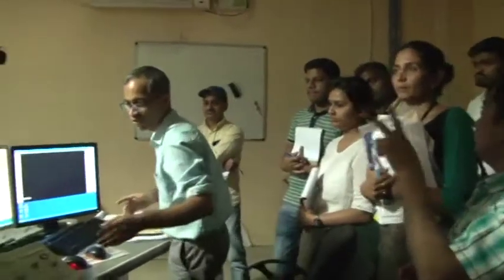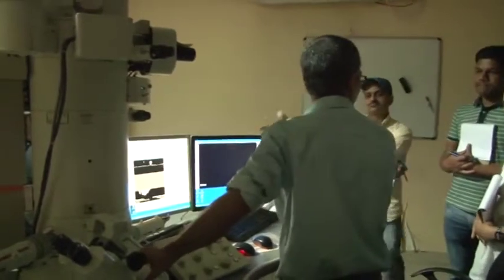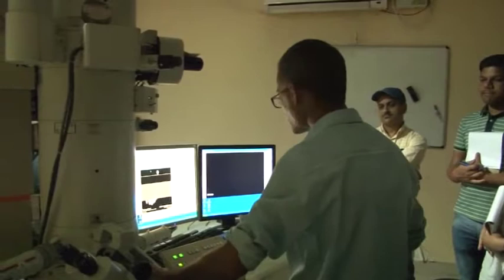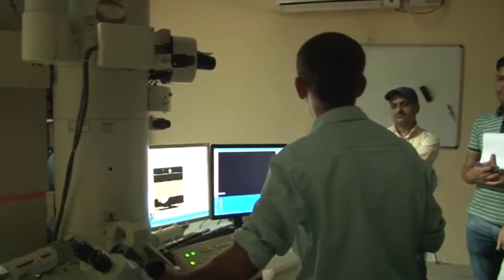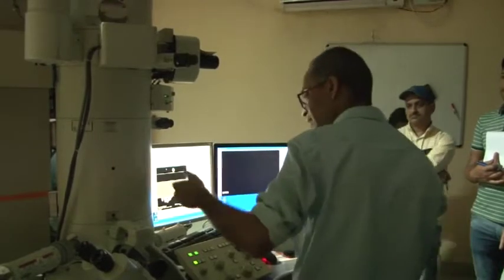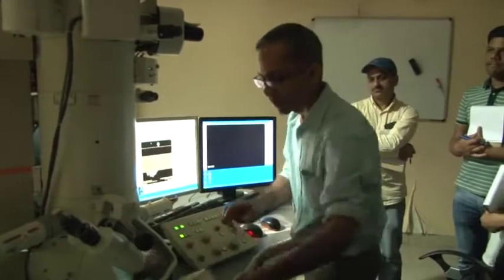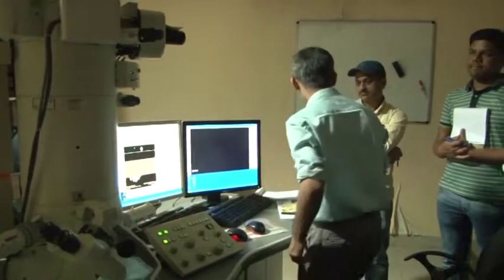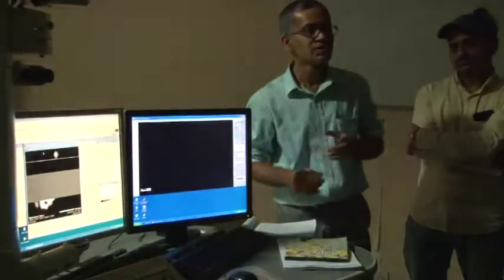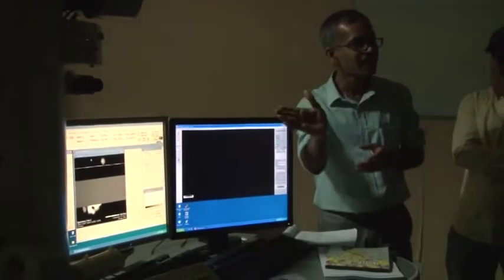We have to remove the fluorescent screen. We have to also block it so that the outside light doesn't interfere, etc. So this is so-called lead glass, which can withstand vacuum, because the whole column inside is under vacuum. Secondly, it should also withstand any X-rays if generated inside the chamber.